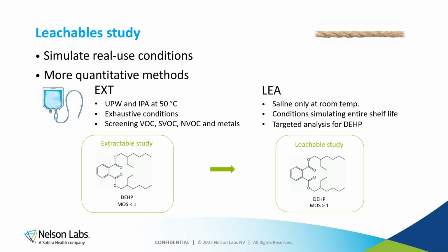Now we did a follow-up study, a leachable study, a more simulated use study, where the bag was extracted at room temperature, using saline only for the entire shelf life. And the plasticizer, the DEHP, was measured with a targeted analysis, so a calibration curve to have more quantitative results on the leachable amount.